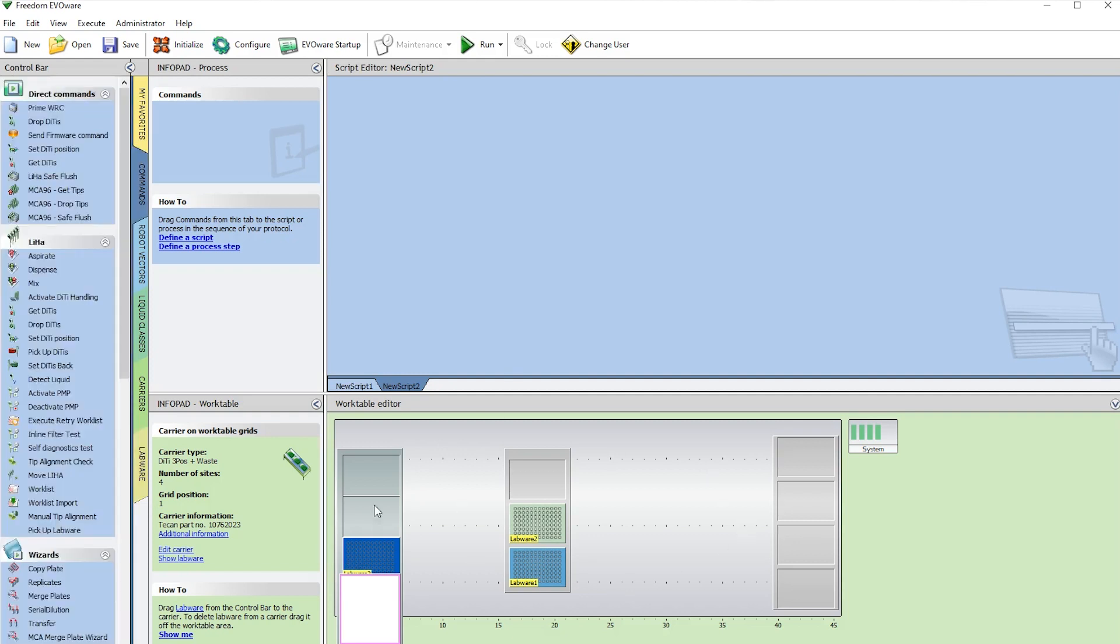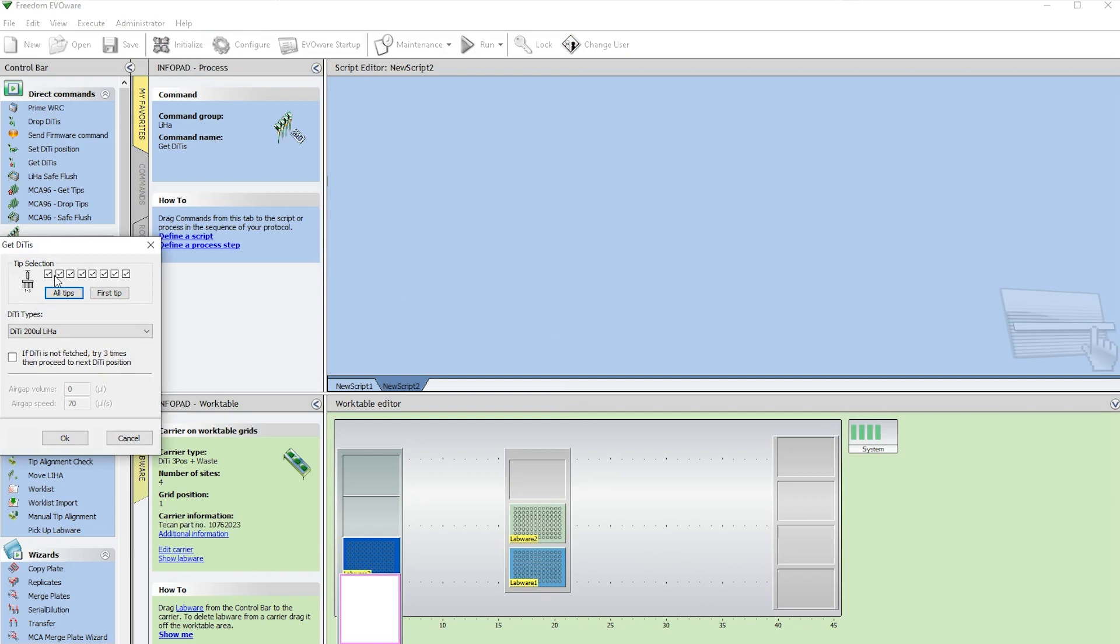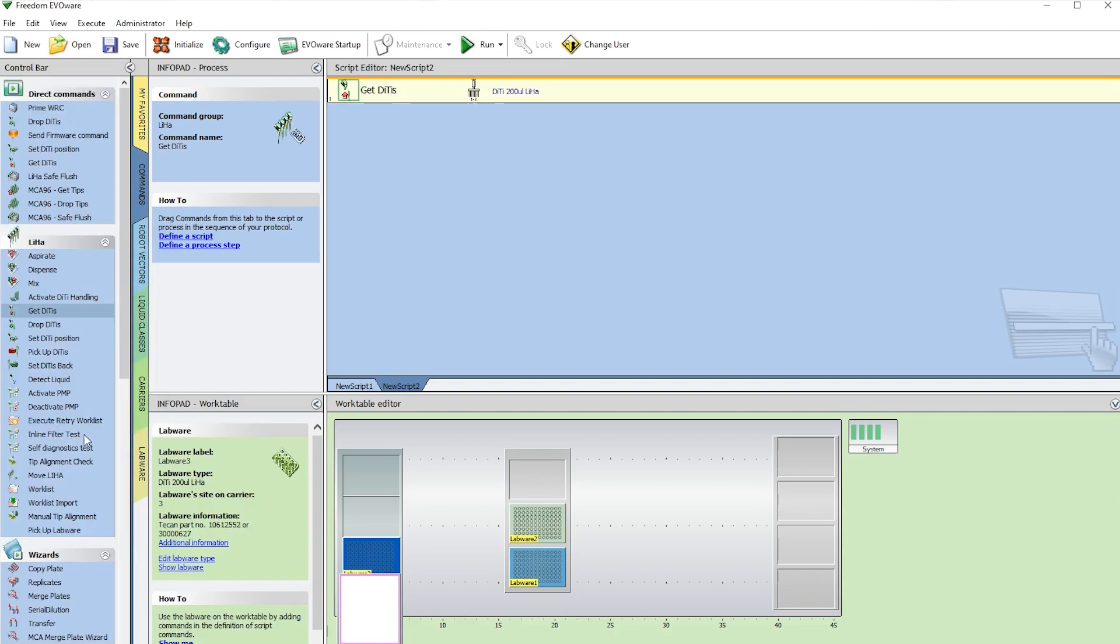Once we have the deck set up, we're going to build the script. The first step in the script is Get Tips. Double-click on it. Now we want to tell it where to pick the tips up from here, and then press OK.